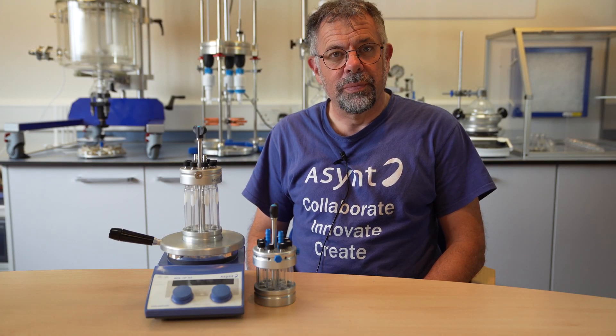Welcome to Asynt. My name's Martin Fordham and today I'd like to tell you about our Octo Mark II.